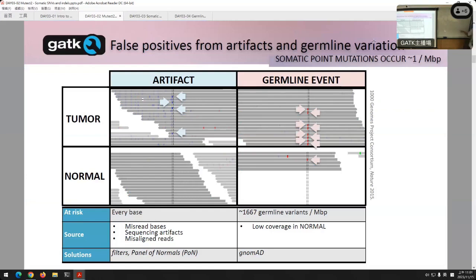Because on the right, you start looking at something unique to this problem space compared to germline calling. What about here? You have very good evidence that you have what appears to be a variant here, right? You can see a little bit of it in the germline sample, but the germline sample has low coverage. So you see some evidence of it, but maybe not enough to call the variant. Doesn't mean it's not there. It just means that you have a difference in coverage, right? But the goal is to really distinguish which mutations are unique to your tumor cells versus the germline one. So that's another source of false positives. You might call that as being novel to my tumor, and yet it's not. So there are some tools we have to also try to get rid of that case as well.